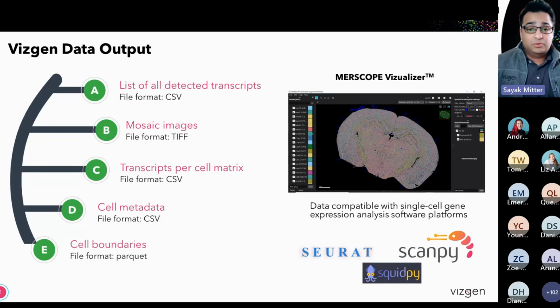Plus, you can also do protein detection for up to 6 different proteins of your interest. So all of these different stains, to recapitulate, DAPI, poly-T, cell boundary stains, and protein stains, are each captured as a microscopy image, and they are stitched together into very high resolution mosaic images and supplied to you as TIFFs for every Z plane.